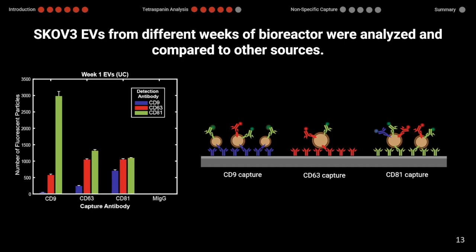And actually, I'm going to combine a couple of questions that we have from John Sperduto, we actually cannot use his mic, and also Carlos Jesus. With the ultracentrifugation that you have used, we can have co-isolations with some lipoproteins. You can also have some sort of impurity or affect the integrity of the EVs. Do you have any recommendations to assess the integrity of those EVs and the presence of contaminants, and how they can affect your detection on the current platform, also by using the antibody biotin capture method?